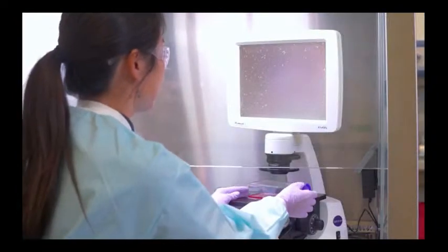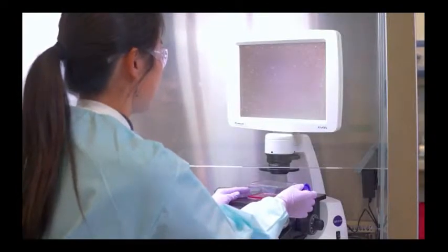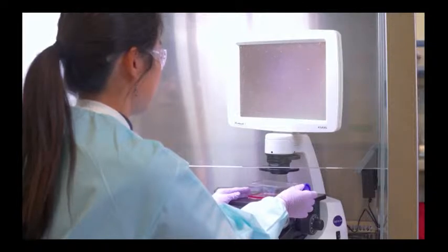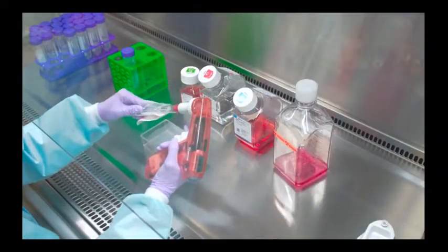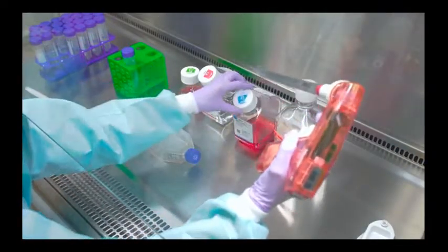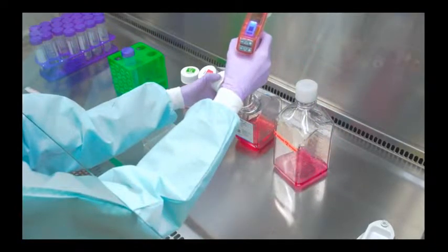Use a microscope to confirm the cells have released from the flask. They will start to appear round as they release from the substrate and will move or slide when the flask is tilted. Complete dissociation is necessary. Do not leave the dissociation reagent on too long, especially if you're using a reagent other than TrypLE.